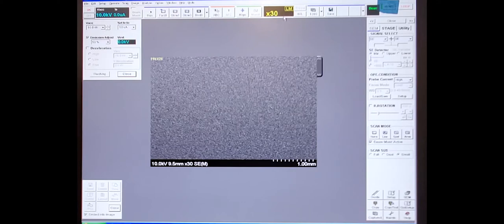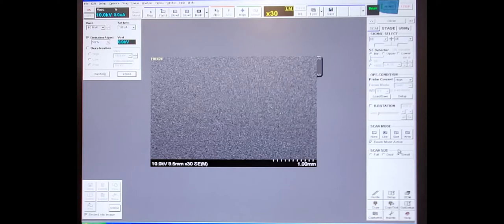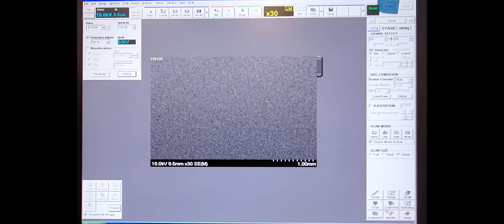Then to the right, you have three tabs. You'll have the stage where you make sure you're at the home center position. The SEM to choose the imaging conditions and the detector types, and the utility for data processing options. Then down at the bottom, the main button you'll probably use is the maintenance tab to check that the vacuum is correct. And then over to the far left on the bottom is where we'll do the image saving.